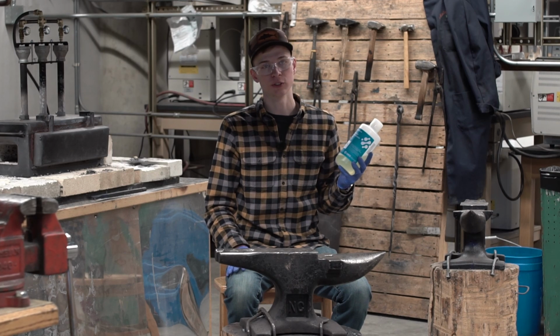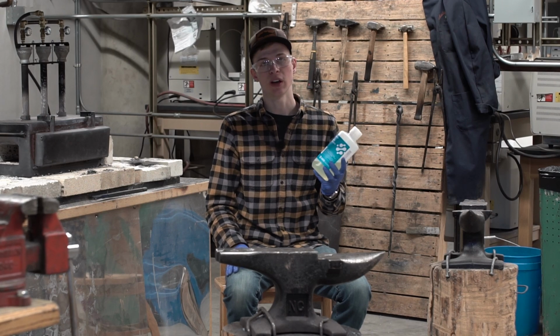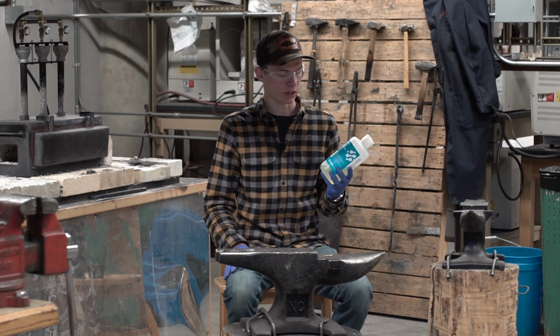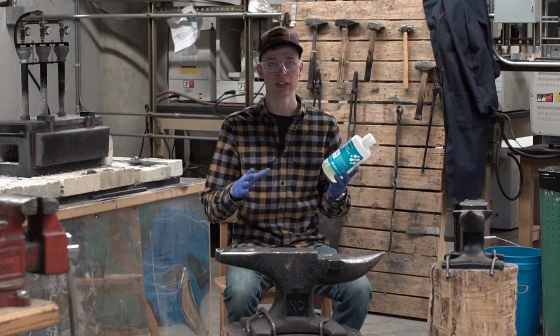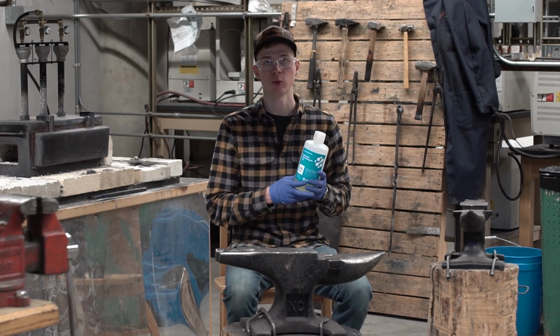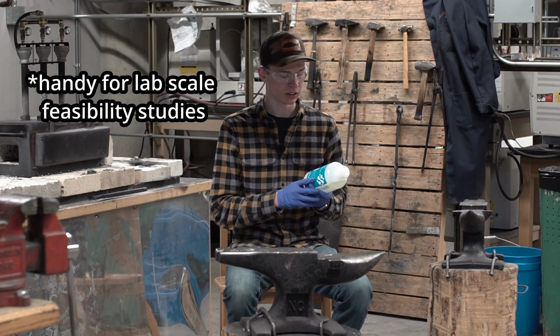You can also do ferrosilicon suspension or magnetite suspension, which is where you have these really fine ground particles of magnetite or ferrosilicon and they're in a suspension, but those settle out over time, whereas this remains in solution, so you don't have to worry about your media settling to the bottom, because then it doesn't really work that well.